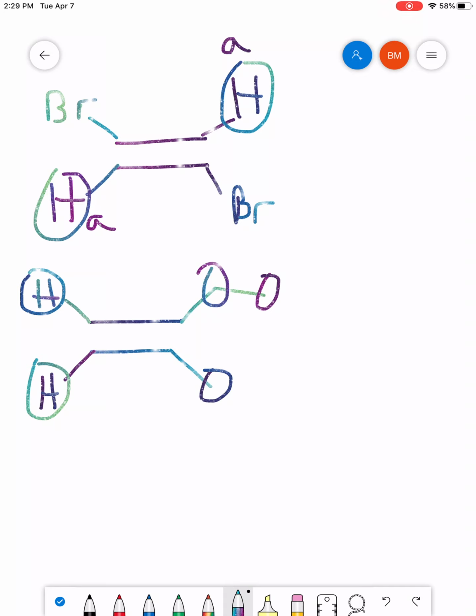All right? Okay, so I think it's pretty safe to say that the ones we have circled over on the right-hand side are all going to be quite unique. There's not going to be any other group. They're not the same as each other. They're not the same as the H's on the left. So these are definitely 3 unique signals.